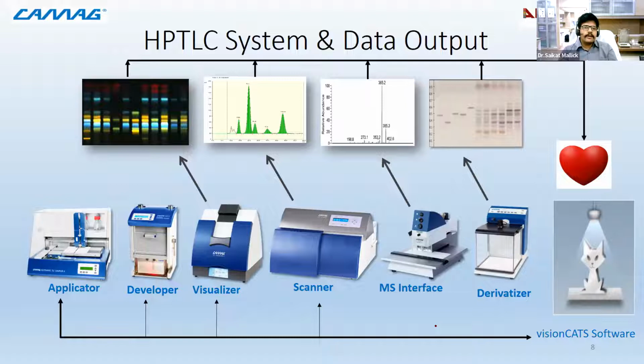Now there are some advantages of having one entire system, and some disadvantages also. The advantage, as I told you, is that manual involvement is minimized. But the disadvantage is that if one person is occupying the instrument, others will not be able to use it until it is free. But the modular structure gives you that advantage. So if myself and my colleague both want to do analysis simultaneously, he does not have to wait for me and I don't have to wait for him.